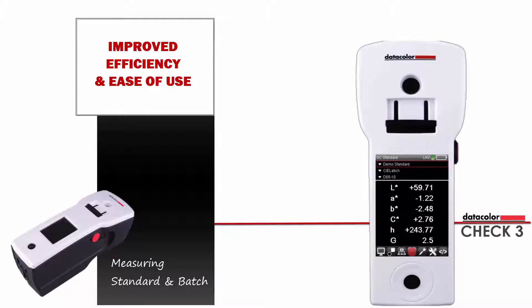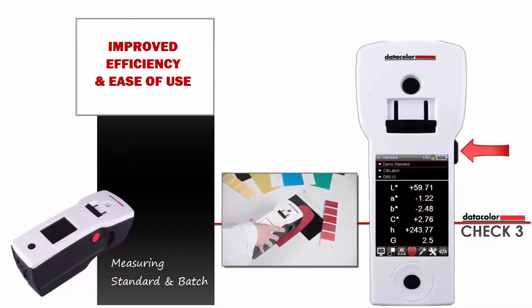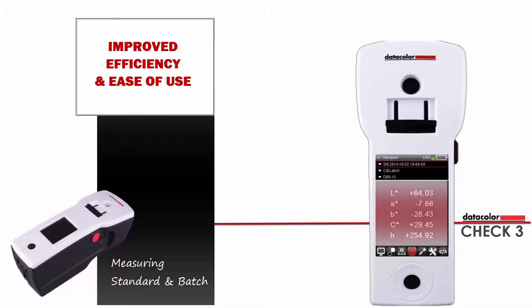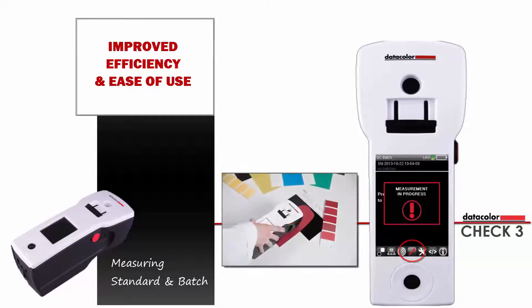On the button bar, the target button is highlighted and the QC standard screen is shown. Position your standard and press the measure button. The standard name is set as the current date. The absolute CLAB coordinates are also shown. Press the right arrow to move to the batch button, then position your sample and press the measure button.